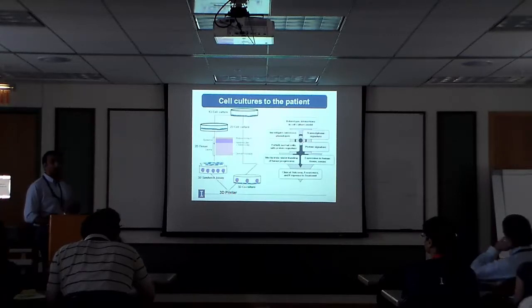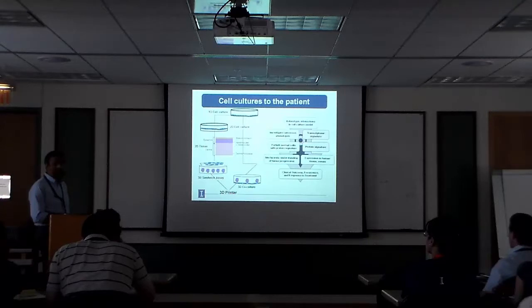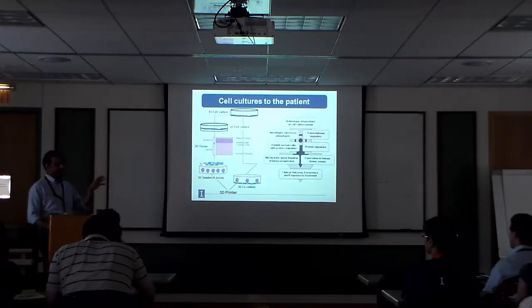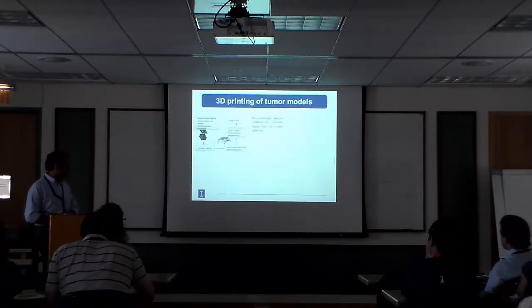What you perhaps saw downstairs in the lab was the 3D printer. So the eventual goal is that we'll not just make this, but we'll actually print a whole microstructure of a piece of tissue for you, right? You would take cells from a patient diagnosed with cancer, culture them, propagate them a little bit, put them into the printer and print out different tumors for that person and see which drug would work, for example, on that person or not, right? So we think we can do this in reasonable time.